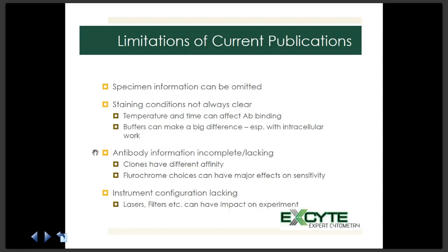Antibody information is often incomplete or lacking. Since clones have different affinity, it doesn't help if you say, we use clone CD3 from Bio-Rad or BD. There's 5 different CD3 clones. Which one did you use?